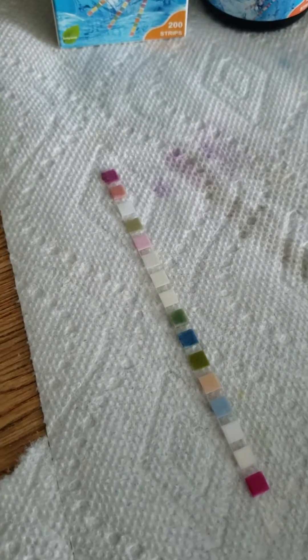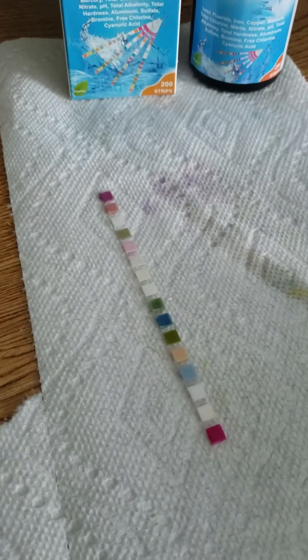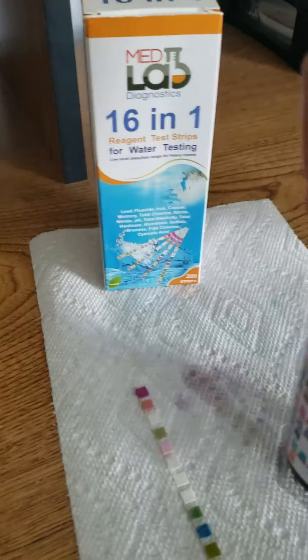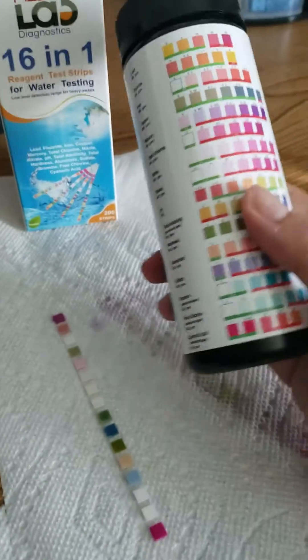You let the color develop for about 60 seconds, and then you read your results and compare it to the color chart that's on the bottle. Just for the sake of time we're going to start comparing now, but when you do this at home you should wait the full 60 seconds before you start to compare.